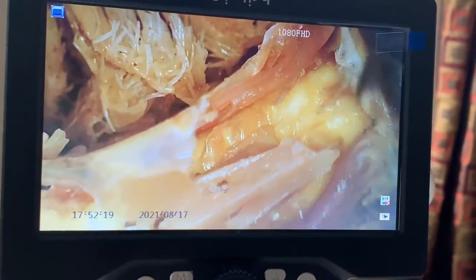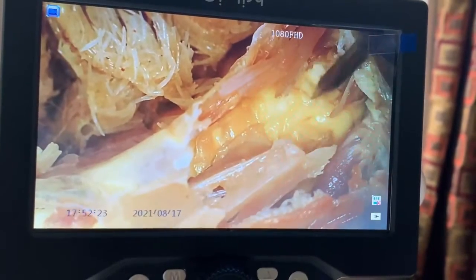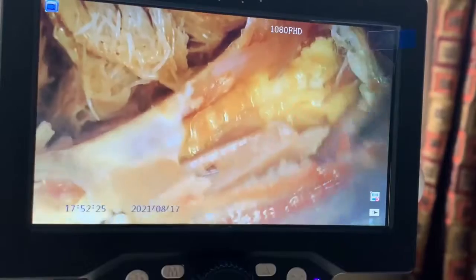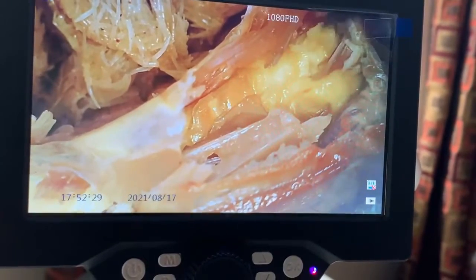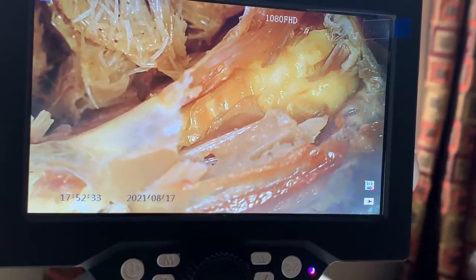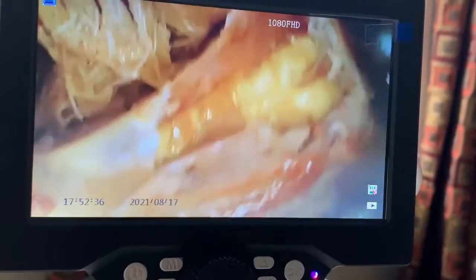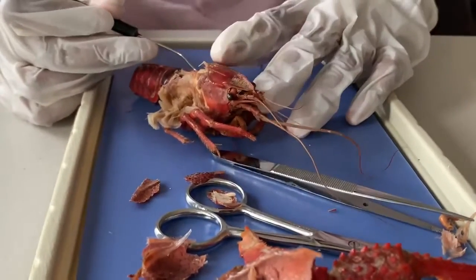On either side of the heart, you can see cream-colored structures — these are the gonads. In the case of a female, it would be the ovary, but since my crayfish is male, it is the testes.